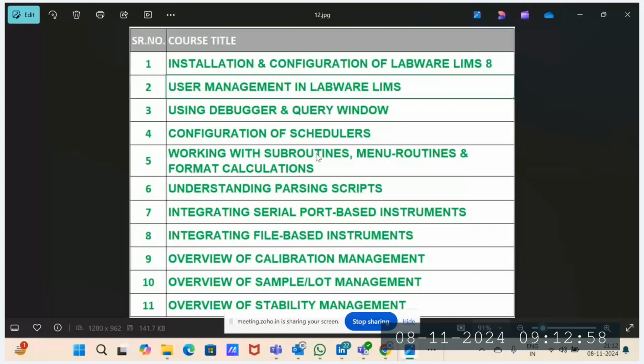We are going to discuss basic information, not intermediate, medium, or standard. We'll discuss intermediate level only. We are not going to prepare our training sessions; I am just going to elaborate basic information: what is the use of a subroutine, how to start a subroutine, how to end subroutine preparations. Such types of activities I will update.